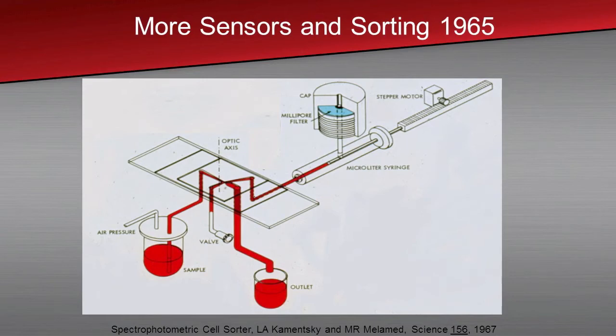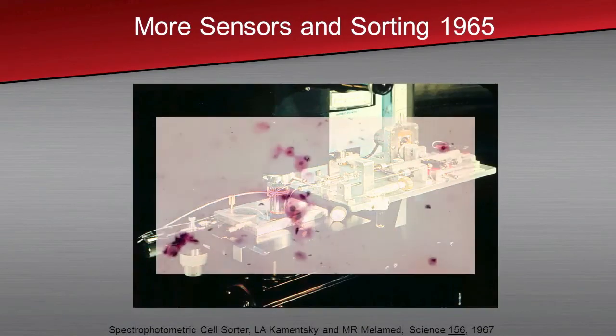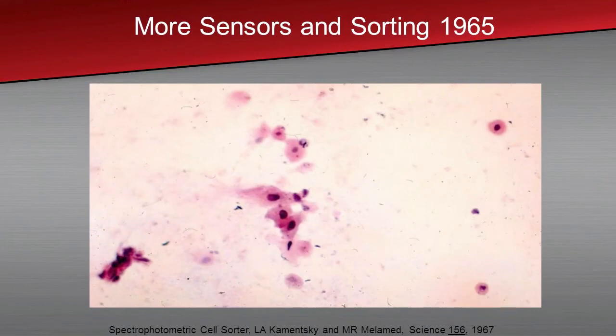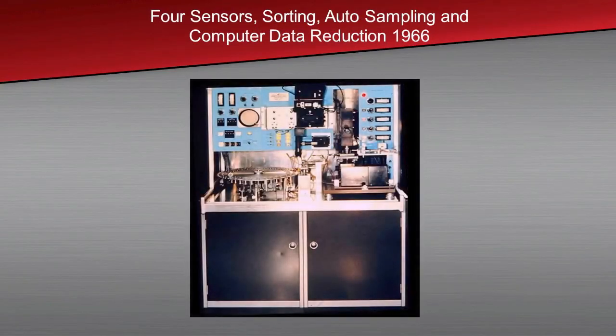And it actually worked, and that paper was published in '67 describing it. That picture is actually showing cancer cells. This is what they look like on the filter. It actually did work.